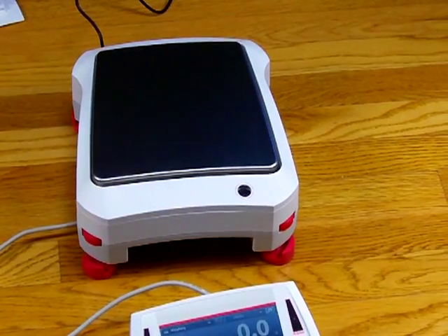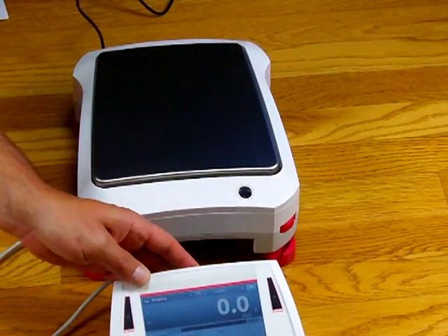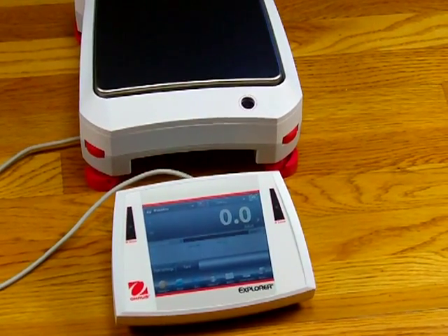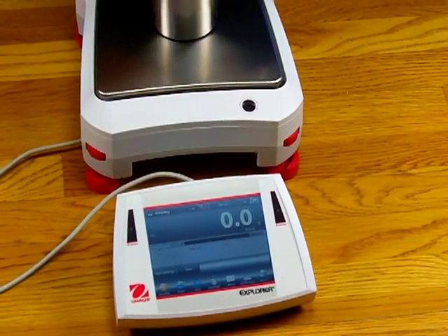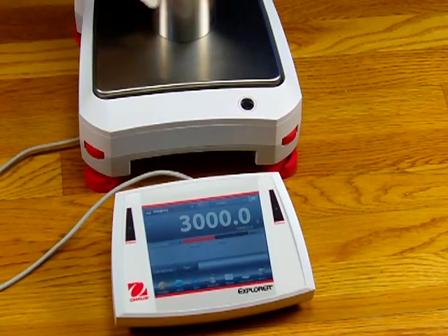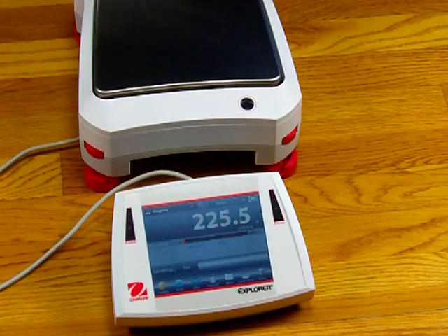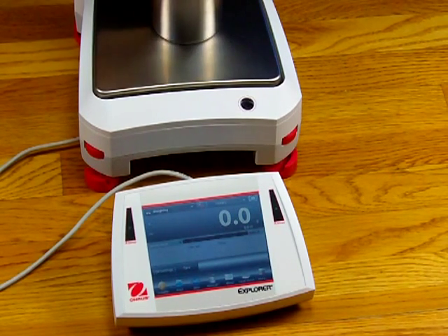This balance has a very intuitive design, quick response, and a large indicator showing the weight results. If I put some calibration weights on this balance, you'll see how fast and accurate it is. Here we have a 3kg weight and it's right on the money. For good measure, we'll put a 4kg weight on the balance.